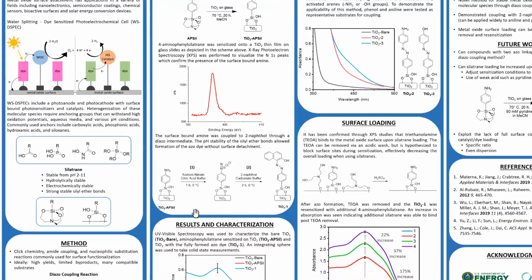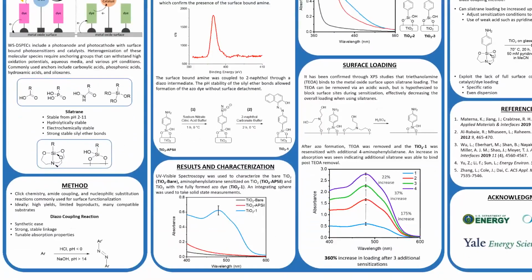Citric acid buffer and carbonate buffer solutions were used to obtain more mild pHs, since the extreme pHs typically used would promote surface detachment. The UV-Vis spectra show that after coupling, the absorbance of the film is moved into the visible region, indicating successful dye formation.